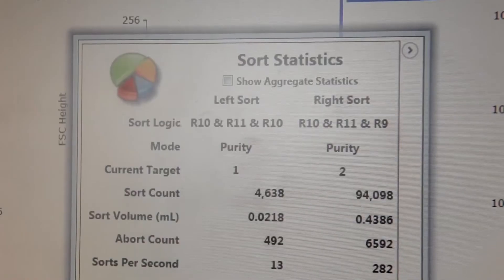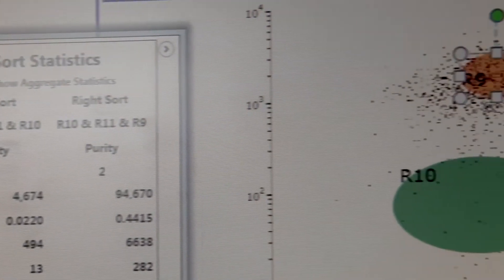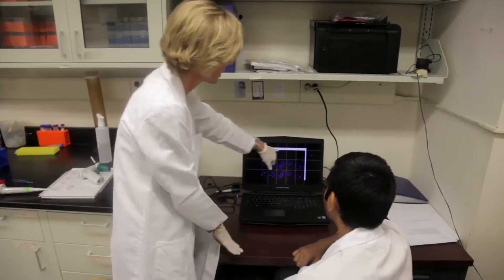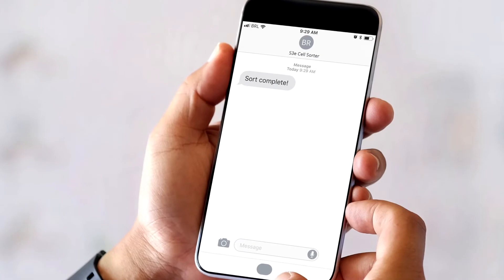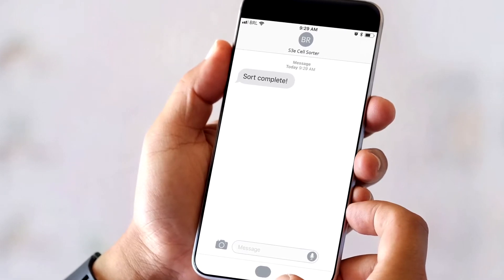You get automated sort monitoring and sample loss prevention features that keep your precious samples safe, while freeing you from sitting in front of an instrument all day. You can get text and email notifications of your sort status even while you're away.